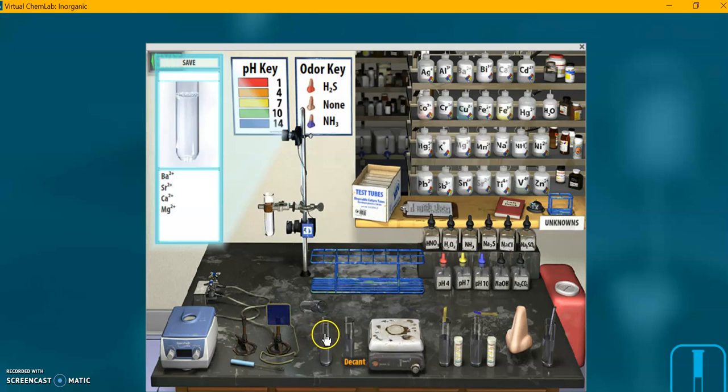This is the decant button. I'm not clicking on them. I'm just mousing over them right now so you can see what these things do. This is the hot plate or heater as they call it.